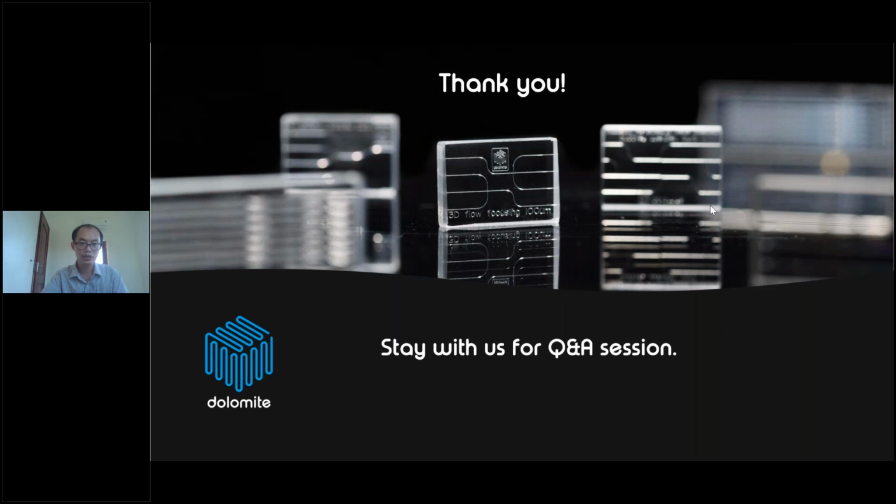Another question: there are different types of lipids, like single chain and mixed mono-, di-, and triglycerides. Which type of lipid would you suggest for using in a microfluidic system? Well, it depends, and there is no limitation in using different types of lipid in the microfluidic system. It depends on your application, so you can choose what type of lipid you use.